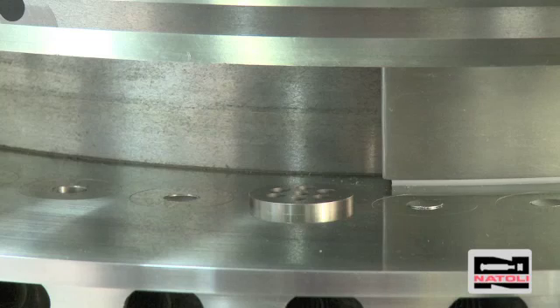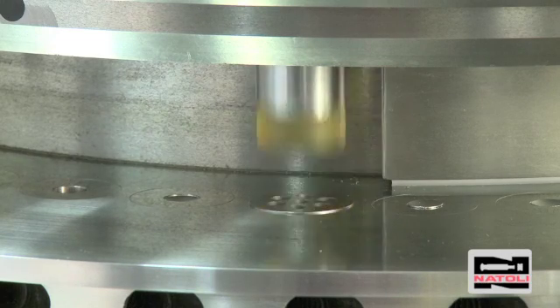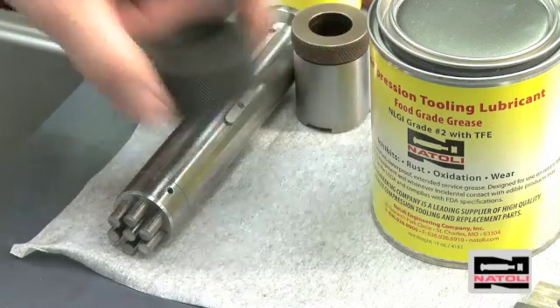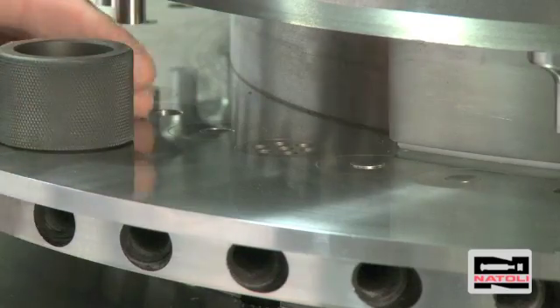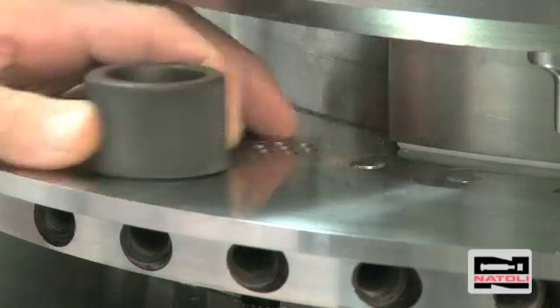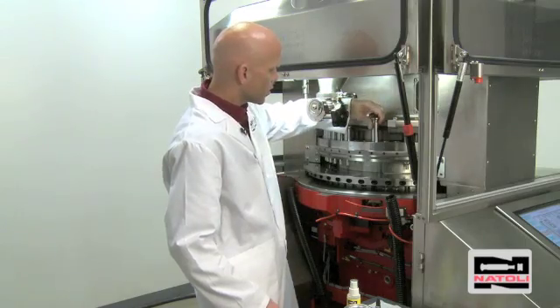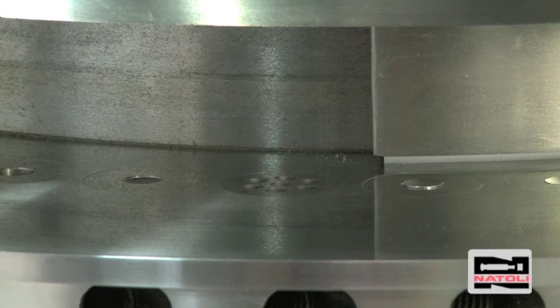We'll take the die driving rod and use it to tap the die into the die pocket. To be certain it's seated properly, take the die insertion ring or a spare die and run it over the turret to make sure the die is flush with the die table. Then take an upper punch and rotate slightly clockwise while applying pressure to check alignment again.